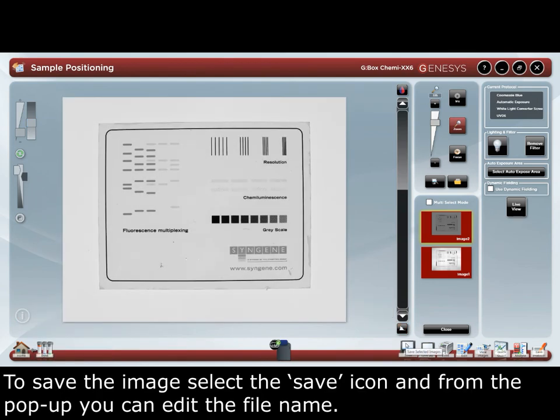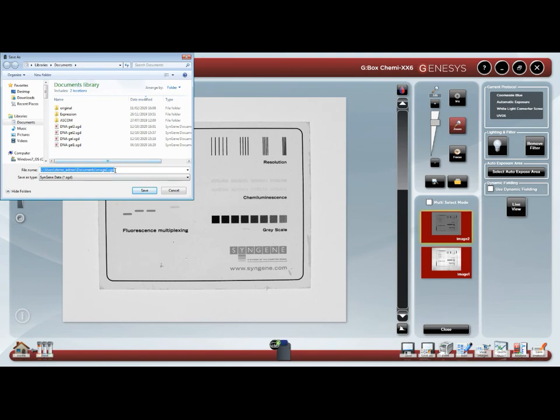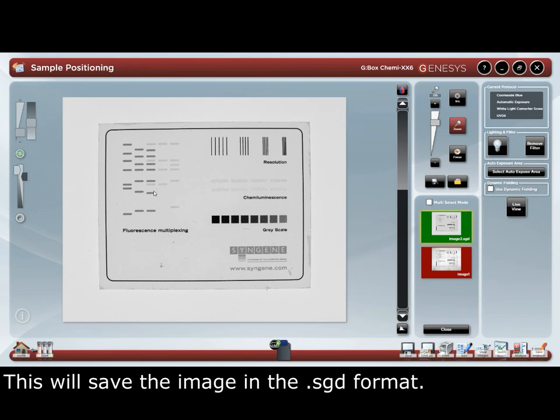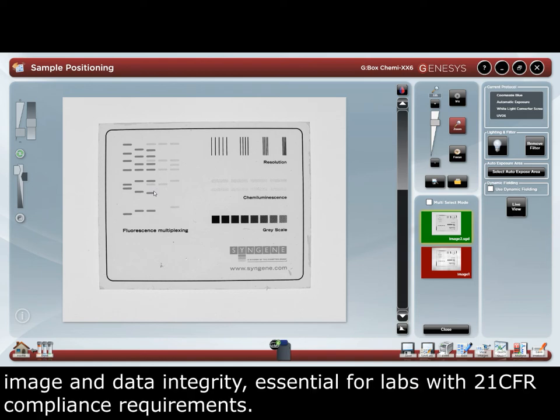To save the image, select the save icon. From the pop-up, you can edit the file name. This will save the image in the SGD format. The SGD format is a fully GLP compliant format that ensures image and data integrity, essential for labs with 21 CFR compliance requirements.